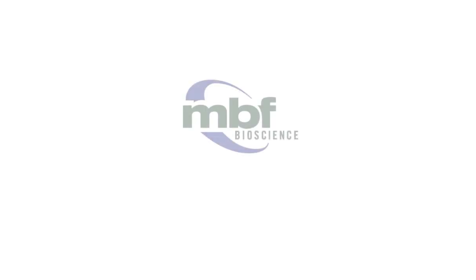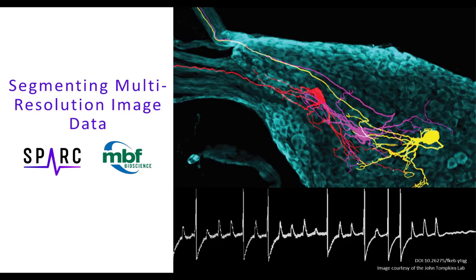In this video, we will explore one example of how a SPARC researcher has utilized the multi-resolution image segmentation strategies MBF Bioscience software can provide.